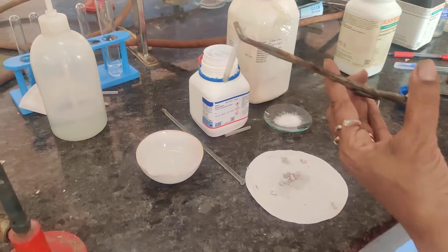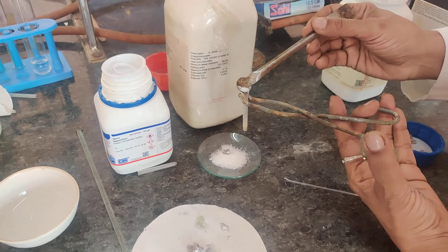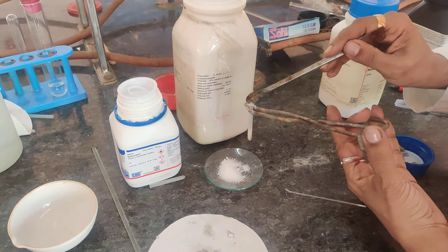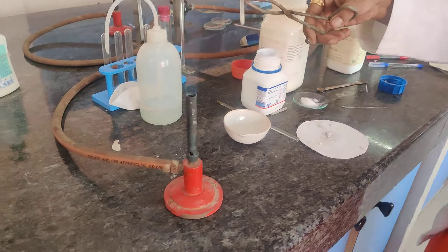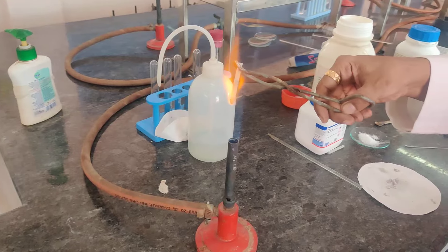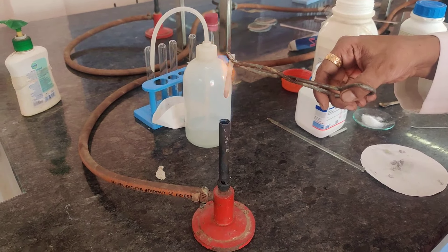To this sodium you then need to add your organic compound. Take a small pinch of organic compound and try to put it into the ignition tube which contains the sodium metal. Now we need the organic compound to react with the sodium metal, and you need to strongly heat it till it is red hot.